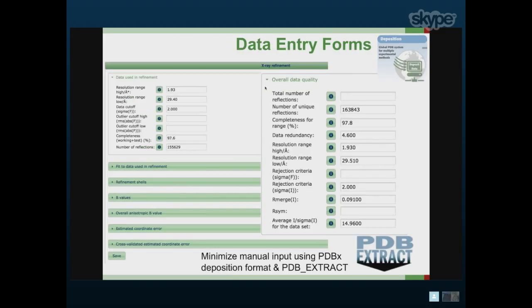So one of the biggest challenges that we have with respect to the more primary data is that the data that we can't harvest ends up having to be manually input through a web interface. And this is certainly most true for data collection and sample related information. So that problem, the fact that we don't have a reliable electronic vehicle for packaging metadata associated with the sample, is a continuing problem for automating the whole deposition pipeline.